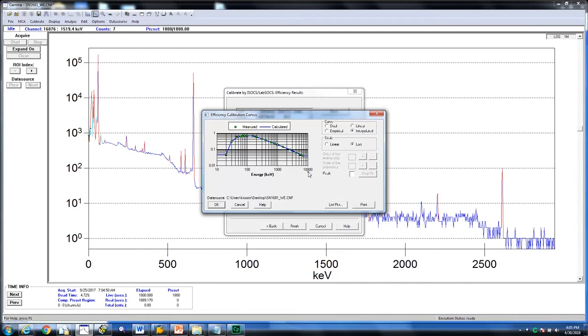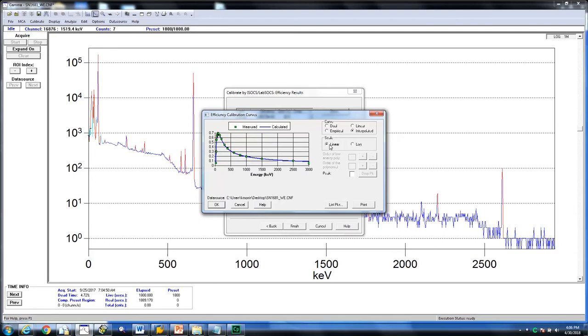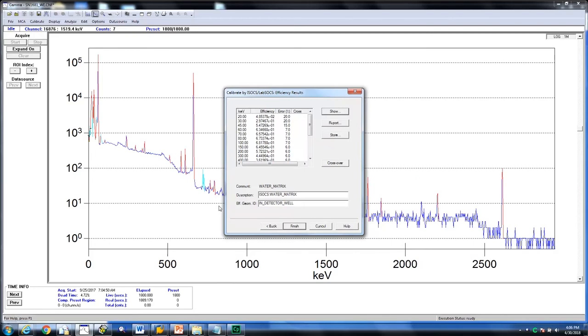We are currently looking at it in log view. It can also be switched to linear view. If satisfied, click OK. Then click finish.